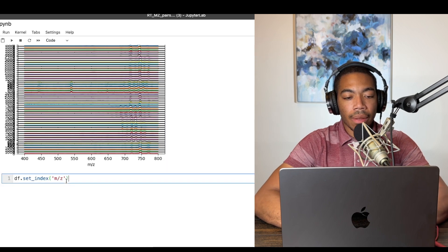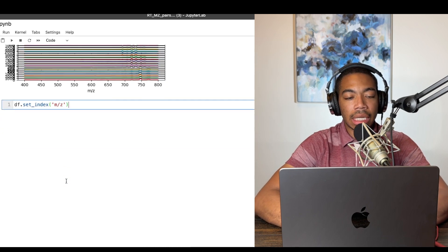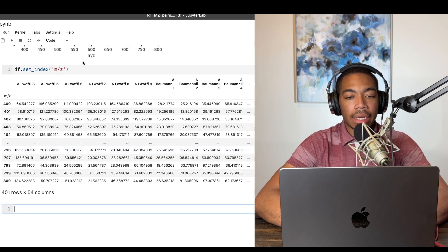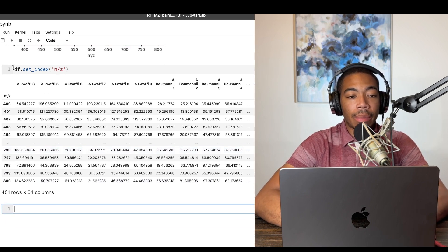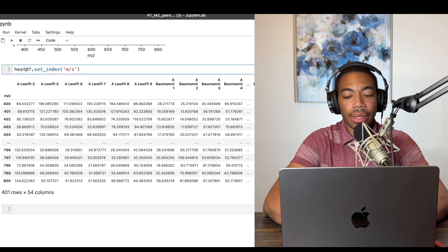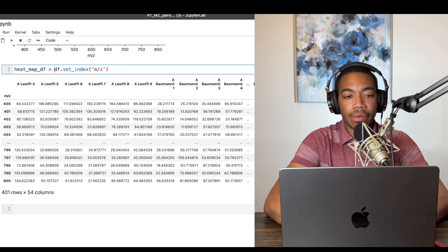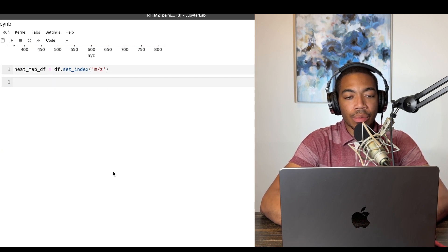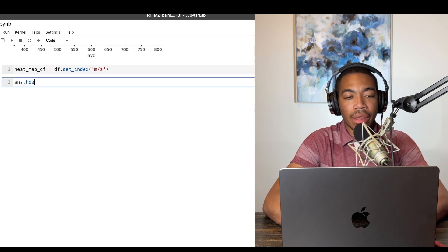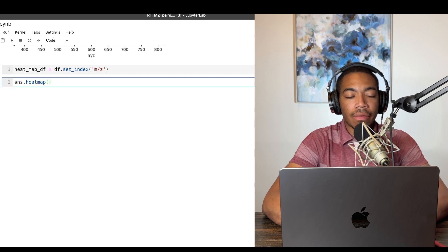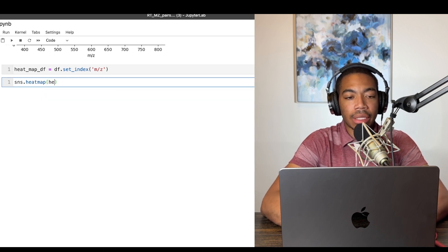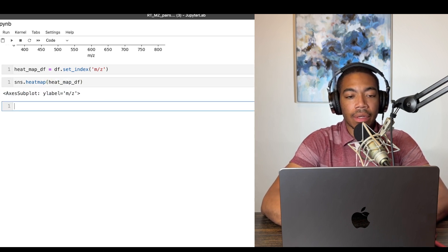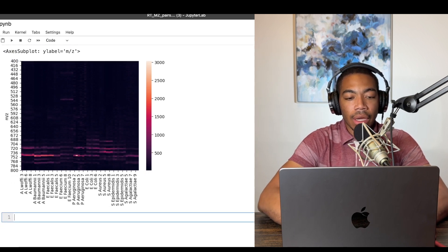So let's take our set index. Let's take this data frame and take another step at how we might plot it. So let's just call this heat map data frame. And that just gives it a cleaner way to run this. And then let's use the sns.heatmap method. And for the data, let's just pass in heat map df. And just start with the default parameters.